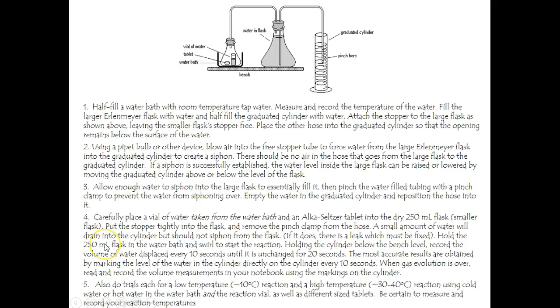Hold the 250 milliliter flask in the water bath. That's this little one here. And swirl to start the reaction. Holding the cylinder, so you're not going to knock it over, I believe, right? Holding the cylinder below the bench level. That's the graduated cylinder there.